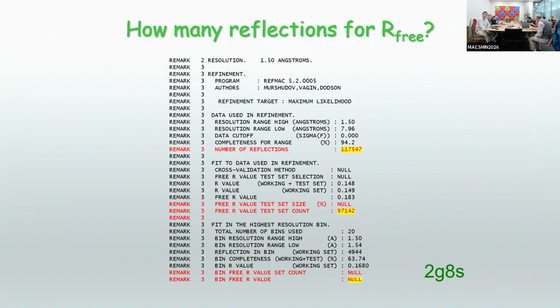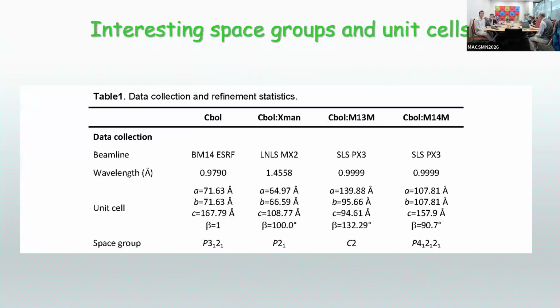Yeah, and then you have to be really quite careful. You don't want the number of reflections used to calculate R-free, which shouldn't ever be more than about 1,000 reflections or 5% of data, whichever is less. But some people just don't remember that. But certainly 90,000 reflections, that's a mistake. But that's in the deposited coordinates. So we cannot truly believe everything that we find.